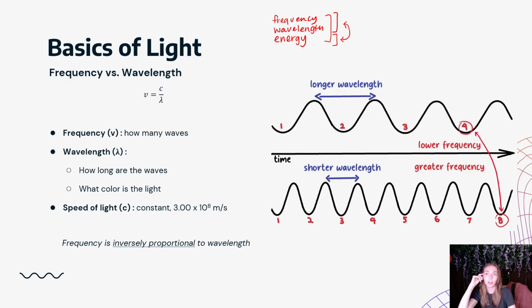The way that we talk about wavelength is that physically, light is traveling in a wave. How wide is the wave? How long are the waves? Wavelength also refers to what color the light is. So depending on the wavelength that you are displaying, that changes the color of the light. Cool? Cool. Frequency is how many of those waves we can fit into a set space.